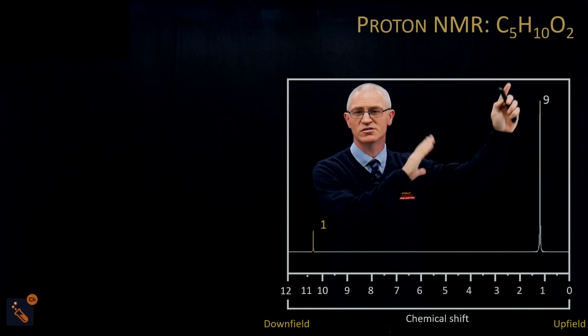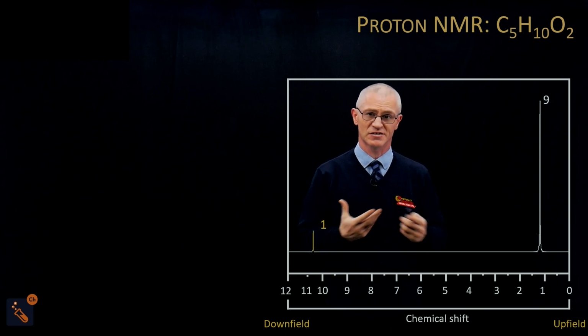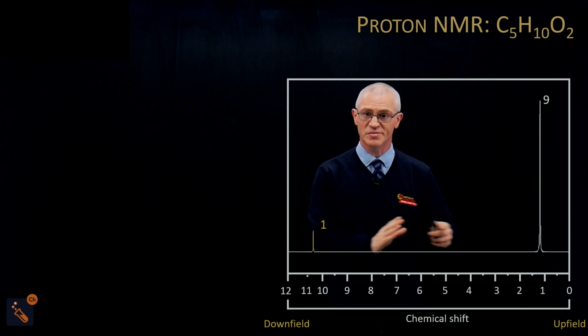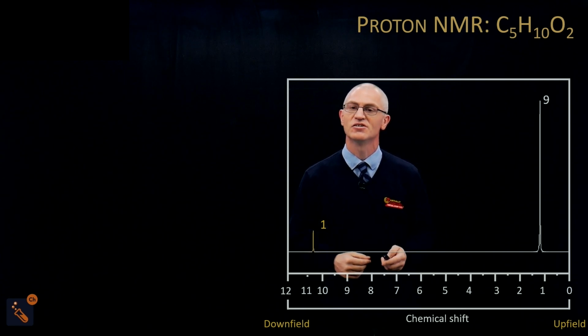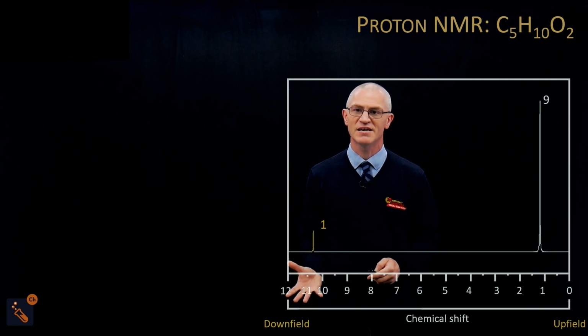I think I've got two oxygens. What am I going to make from two oxygens? Okay, ester or carboxylic acid should come to mind. An ester is not going to be indicated because there are no hydrogens on those oxygens in the ester, but a carboxylic acid is shown because there's a hydrogen on the carboxylic acid, and that comes out between 10 and 12.